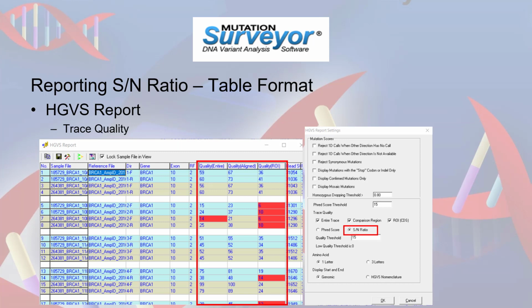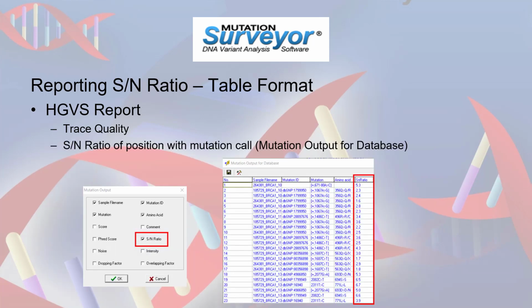As mentioned, the signal-to-noise ratio can be included in the output of some reports. The HGVS report is one of these reports that provides this output option. In the HGVS report, the signal-to-noise ratio can be used to measure and report trace quality. A threshold can be set to alert users of trace files with average trace quality values that fall below their standards. The output for mutation database subreport also includes settings for reporting signal-to-noise ratio information. However, in this report, the option is to include a signal-to-noise ratio column that provides the signal-to-noise ratio value for that position with the mutation call.